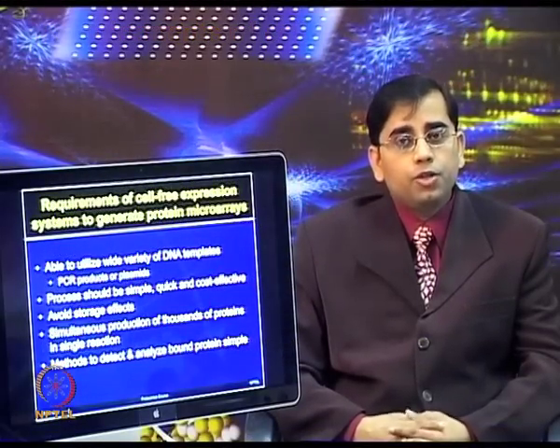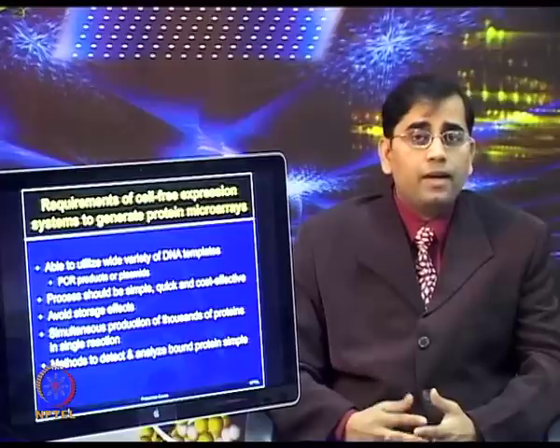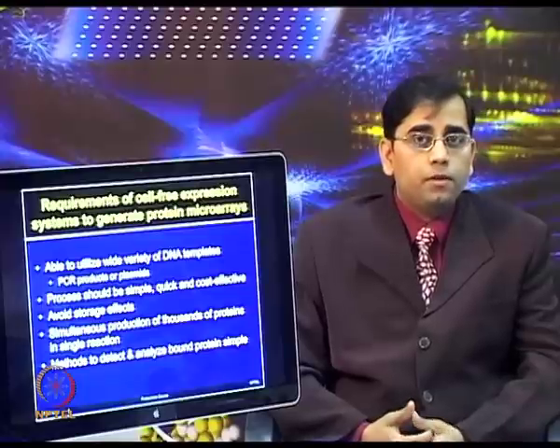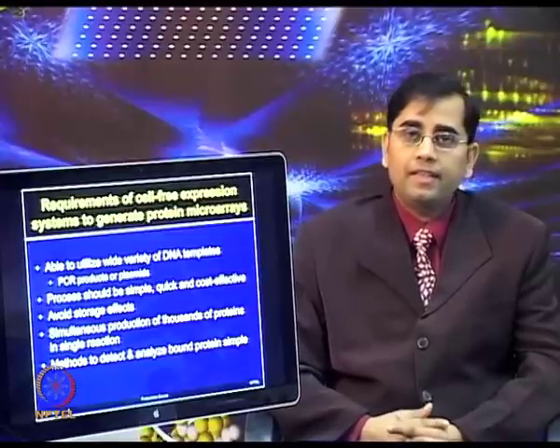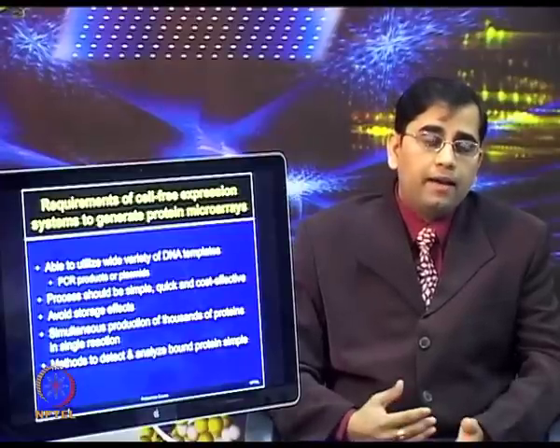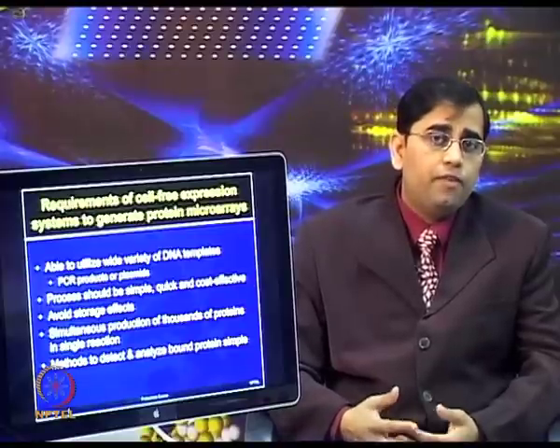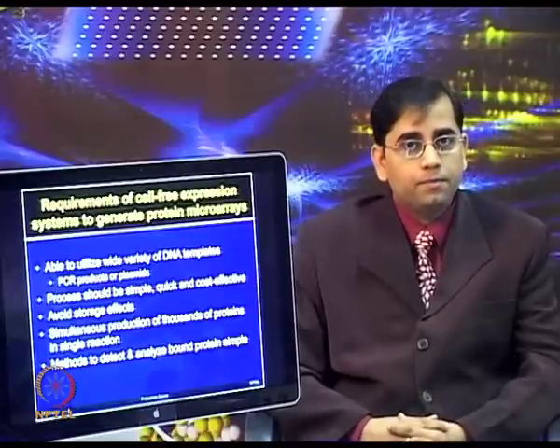The microarrays should be produced on demand, so that one can avoid the storage effects. Most of the purified protein arrays have to be stored at -80 degrees, and storage and then repeated thawing affect protein integrity and protein functionality.